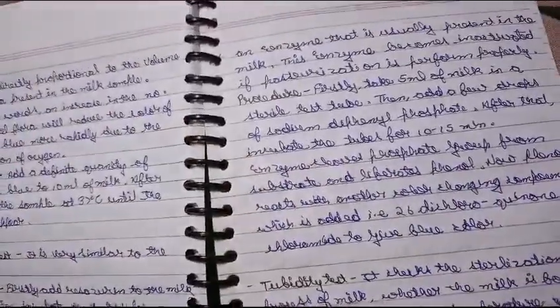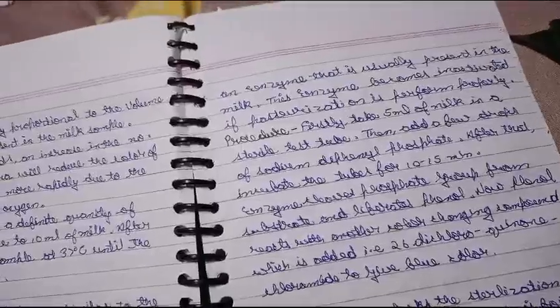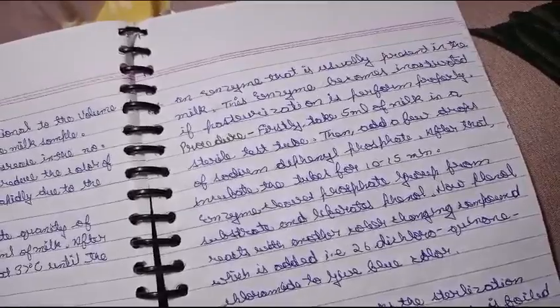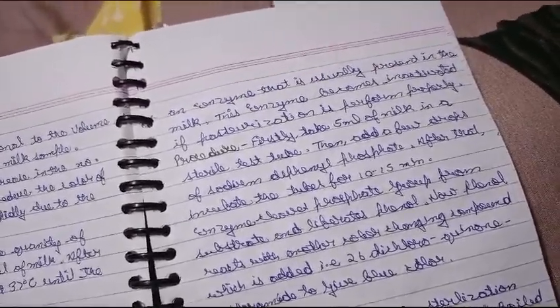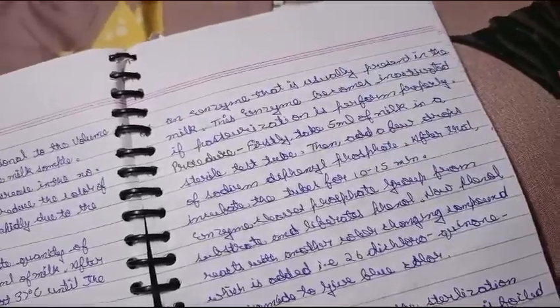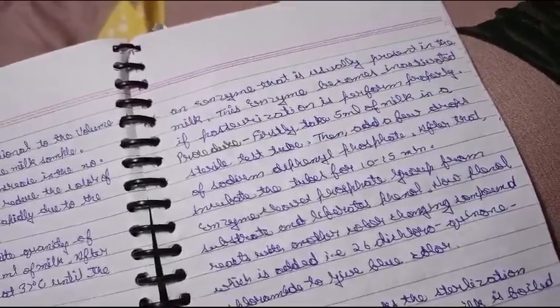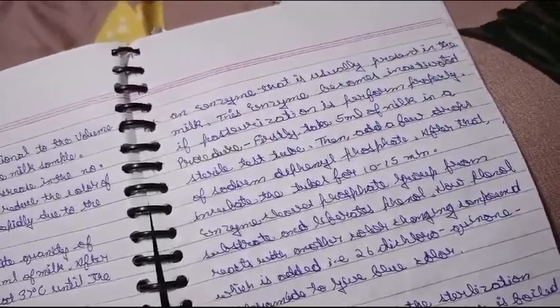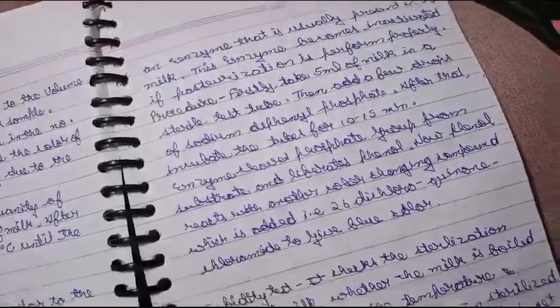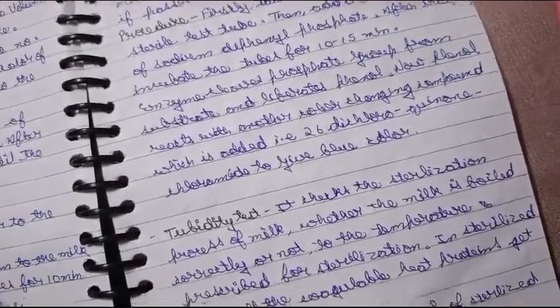Procedure: first, take 5 ml of milk in a sterile test tube, then add a few drops of sodium diphenyl phosphate. After that, incubate the tubes for 10 to 15 minutes. The enzyme cleaves phosphate groups from the substrate and releases phenol. Now phenol reacts with another color changing compound which is added, that is 2,6-dichloroquinone chlorimide, to give blue color.